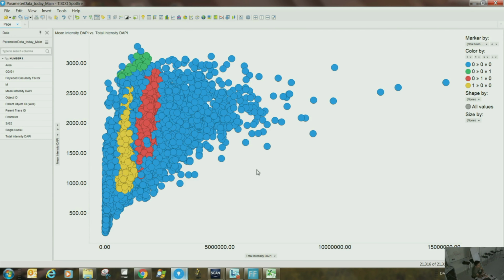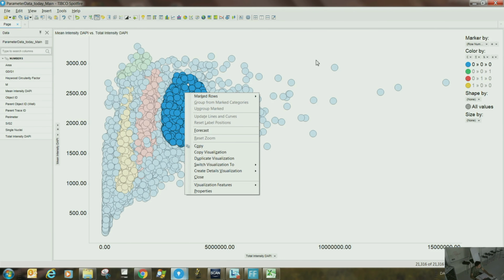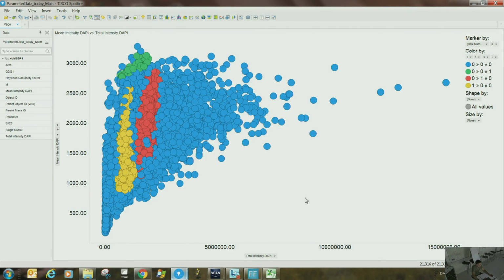So basically you can do it either in Scanner, or you can just do your segmentation in MATLAB or Scanner and directly come here and make this kind of marking by yourself, and then you can give the naming. Naming, I will tell you how to label it later. But this is how you actually visualize the data. Okay. So about that.